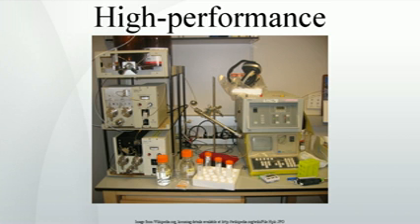NPHPLC uses a non-polar, non-aqueous mobile phase, for example chloroform, and works effectively for separating analytes readily soluble in non-polar solvents. The analyte associates with and is retained by the polar stationary phase. Adsorption strengths increase with increased analyte polarity.